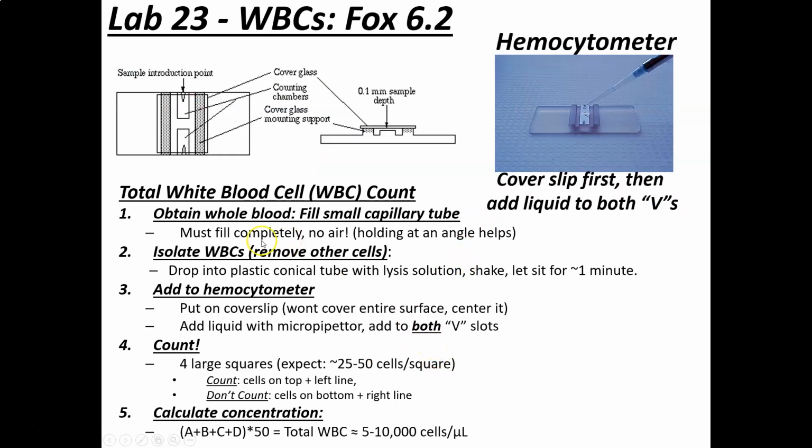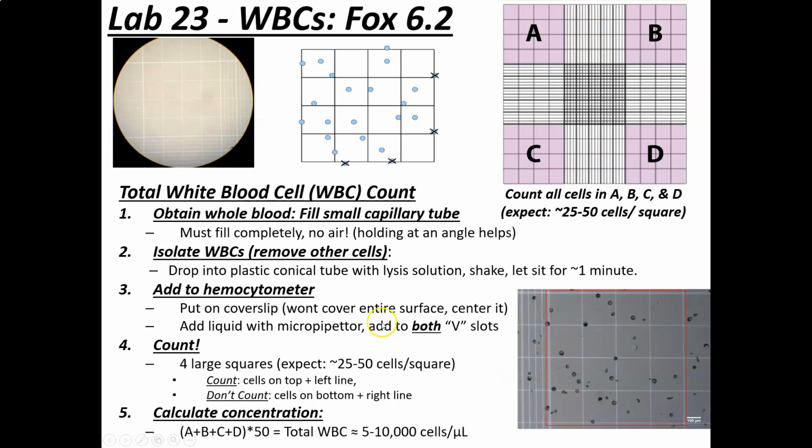It's going to be the same thing we did before. You're going to have a cover slip on, you're going to go to those little notches, you're going to fill up each side with blood and the solution, and then you're going to throw it under a microscope and look at it. There are a couple major differences though.